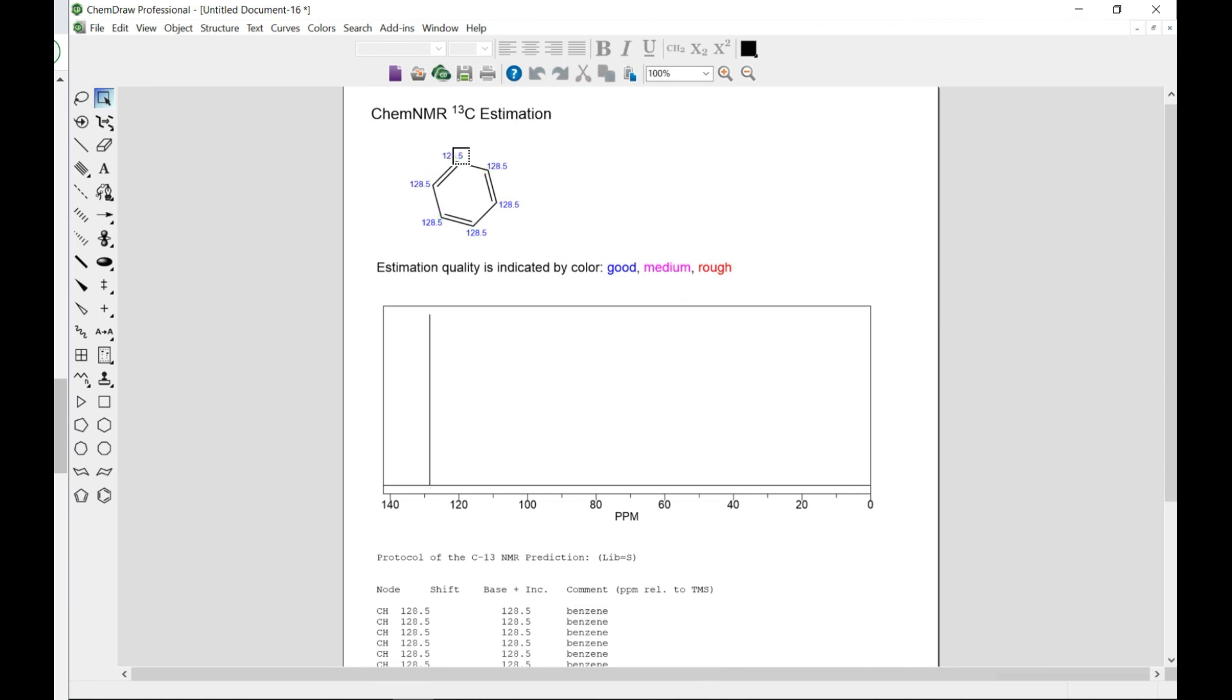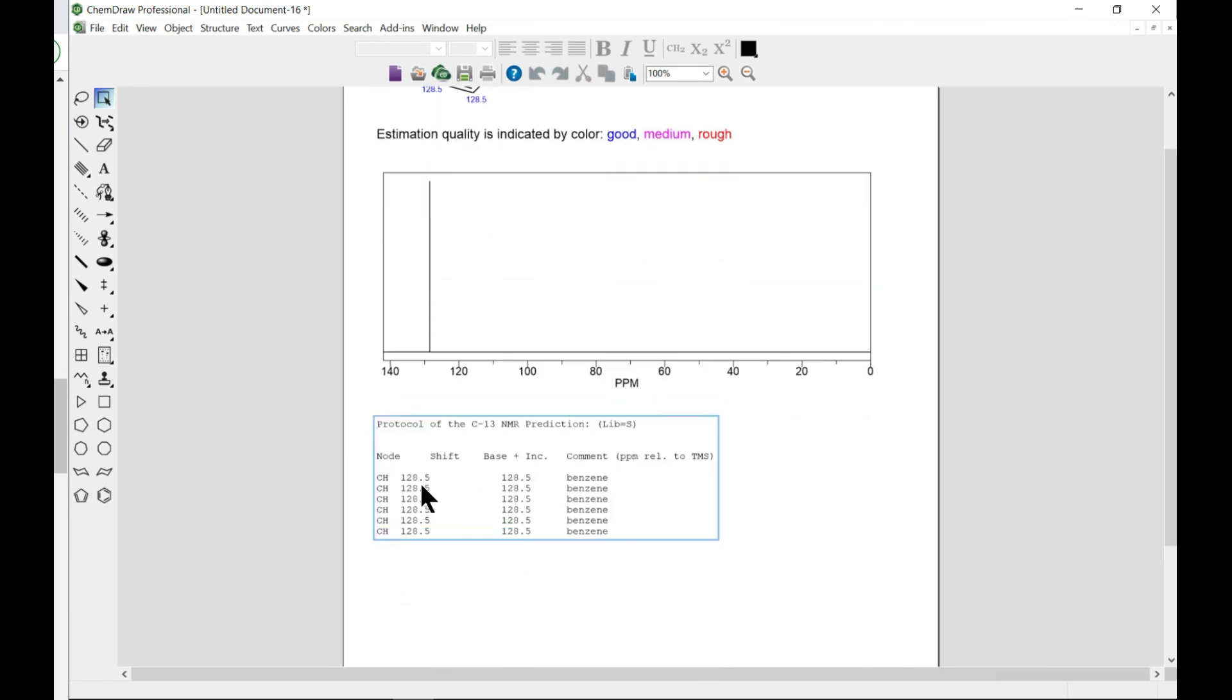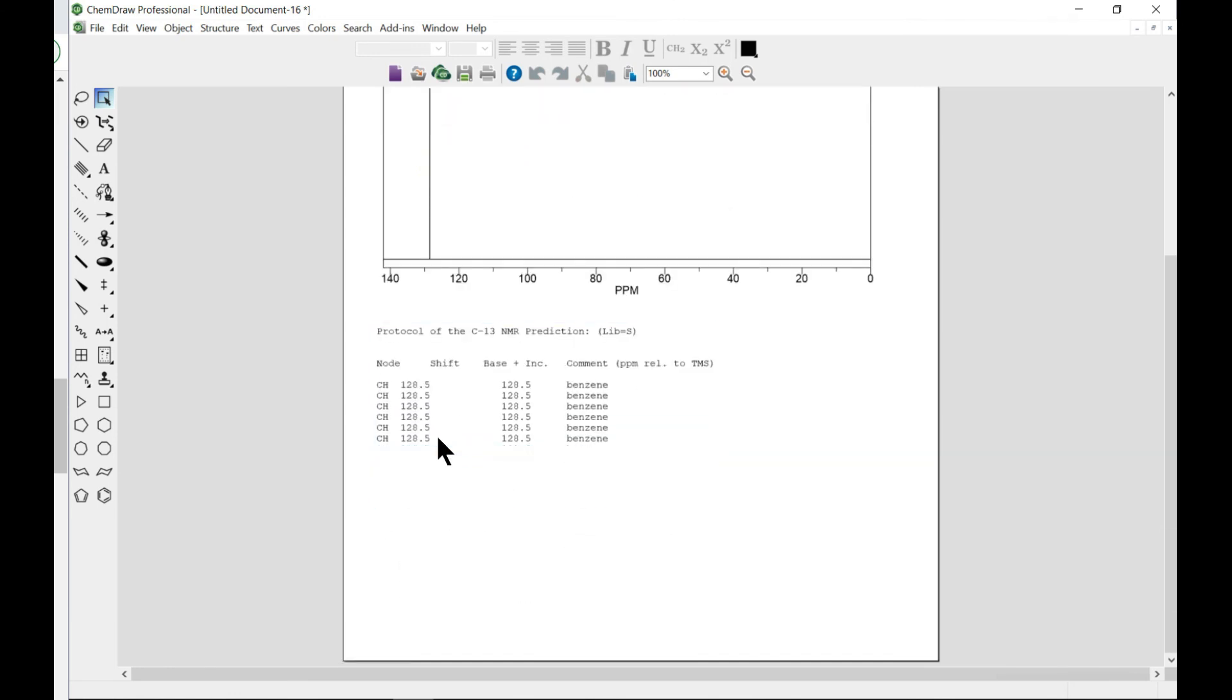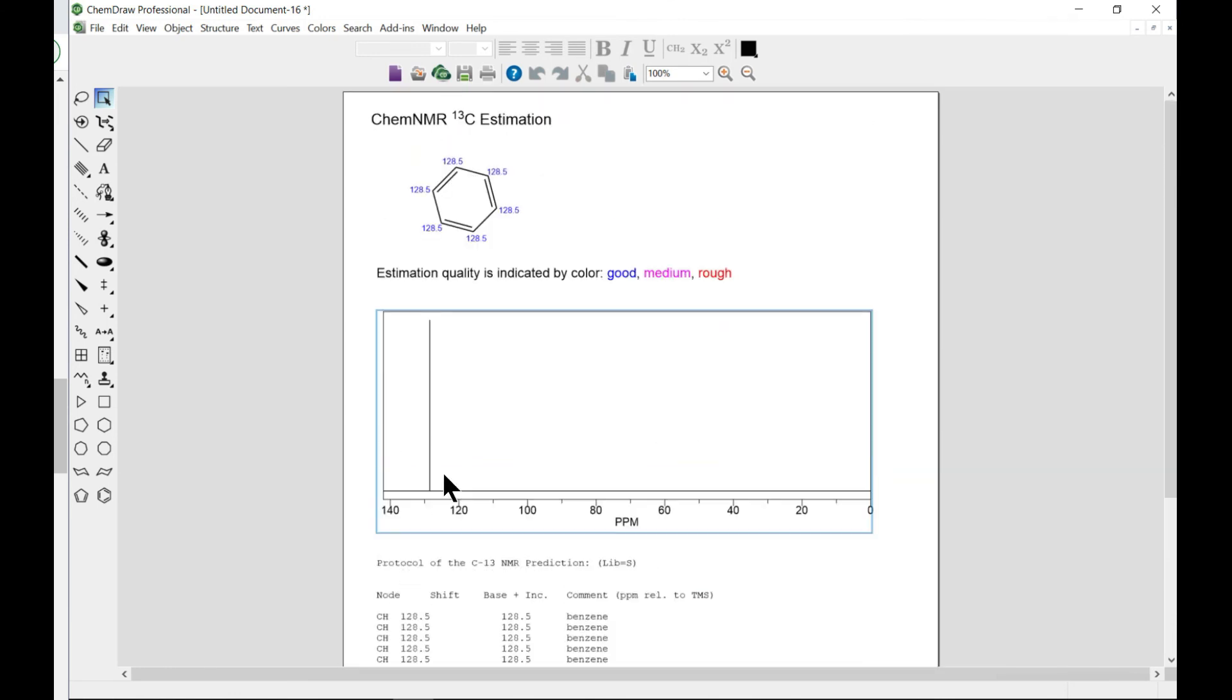So it's just the same thing around it, which is a nice way of testing to see if it works well. So that will be it for ChemNMR.